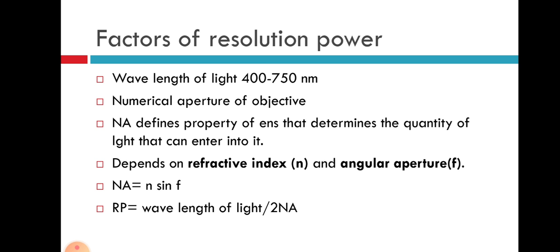In the same way, the formula for resolution power is equal to the wavelength of the light divided by 2 into numerical aperture.